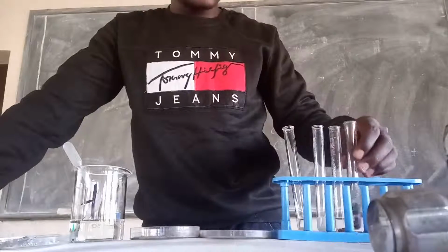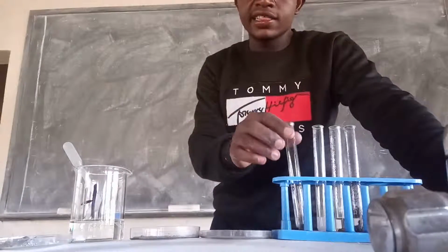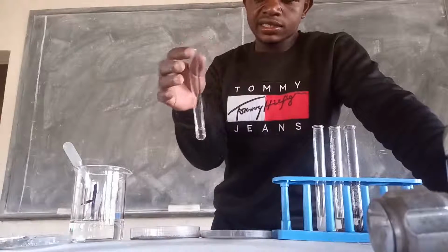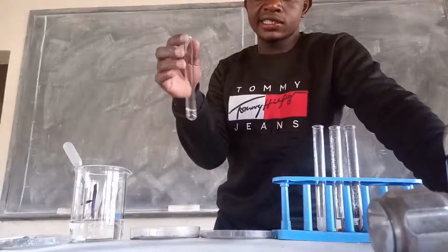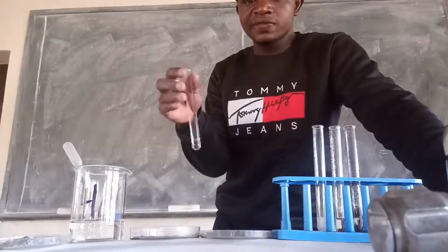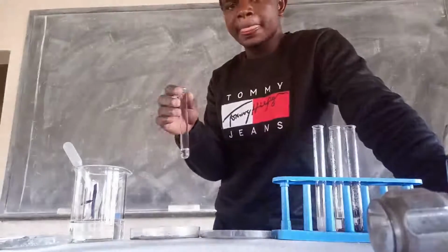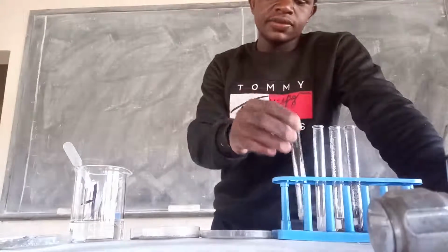So from these 4 test tubes, I can say that the first test was very fast, because hydrogen gas was being produced at a faster rate.